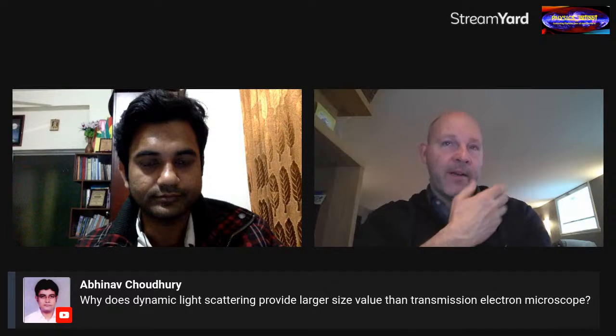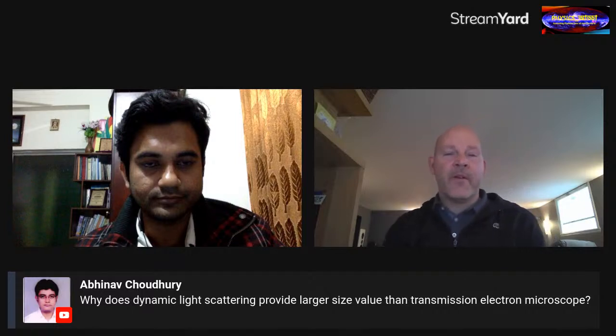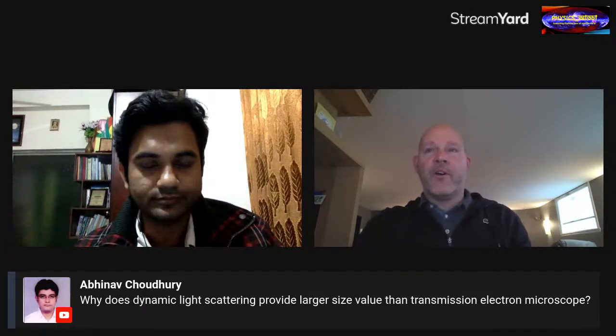And optical light has wavelengths in the hundreds of nanometers. The typical range given for the optical spectrum is between 400 and 750 nanometers, and so that sets a lower limit on spatial resolution for 400 nanometer light of about 200 nanometers or so. From that simple description, you can understand why there's no possibility of making atomic resolution images of materials with any sort of optical technique. The Rayleigh resolution requirement forbids it. The maximum spatial resolution you can expect from a light microscope is on the hundreds of nanometers length scale.